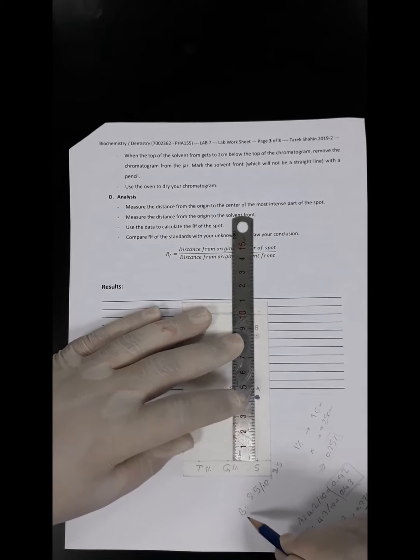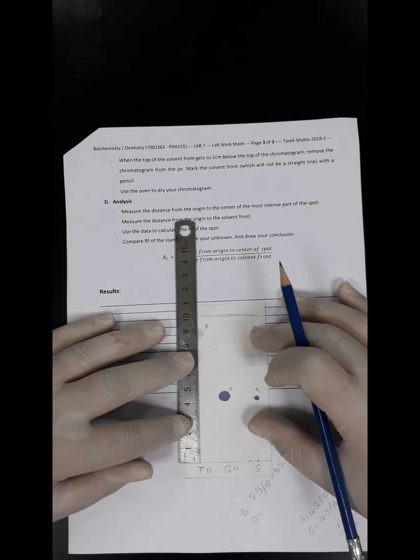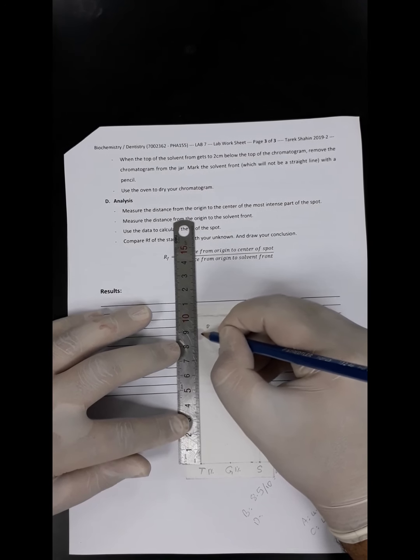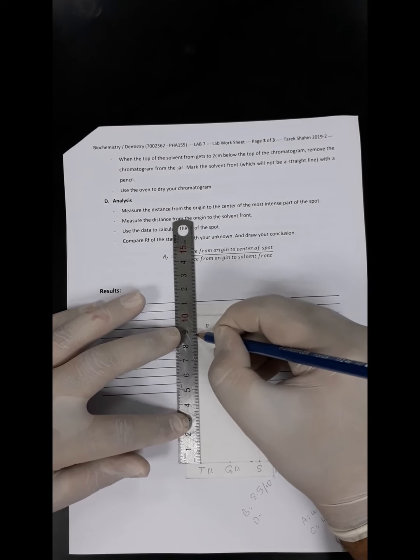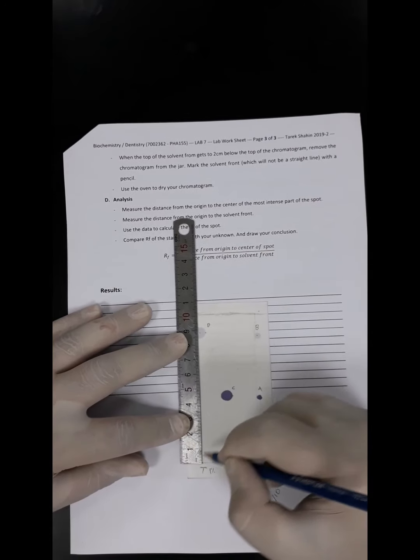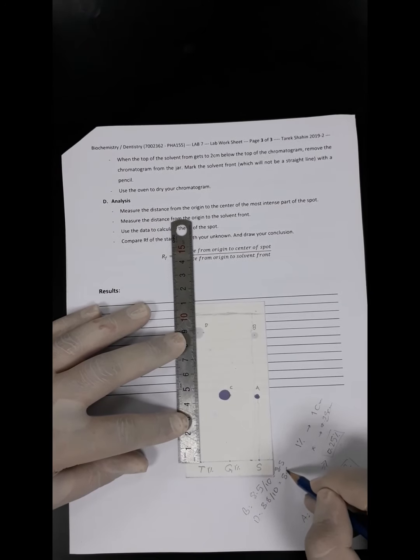And then for spot D, which is this one, we again calculate from here to the center, which is, I think, 8.8. So 8.8 divided by 10, from here to there, which is equal to 0.88.